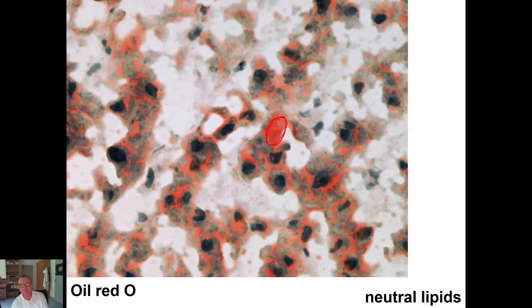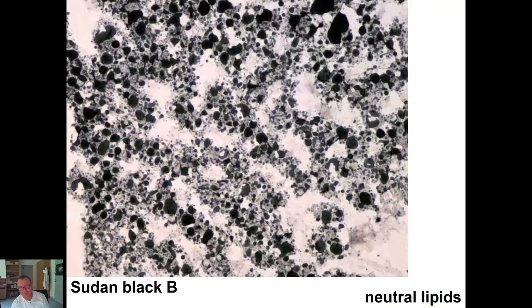So this red thing is a lipid droplet, which was white in the specimen you already saw last week in the practical training, and lipid staining can be also black. So here in this specimen there are black lipid droplets in adipose tissue, which you saw in paraffin section containing white bubbles.